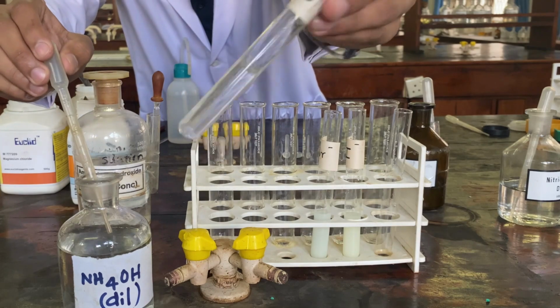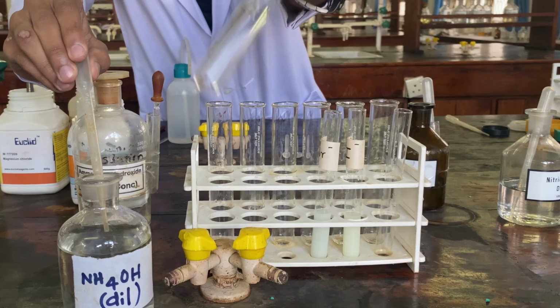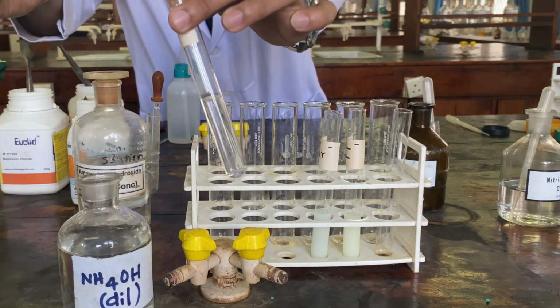Here we are adding diluted ammonium hydroxide solution dropwise. You can observe the precipitate dissolves.